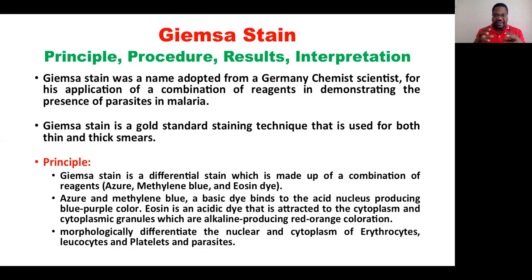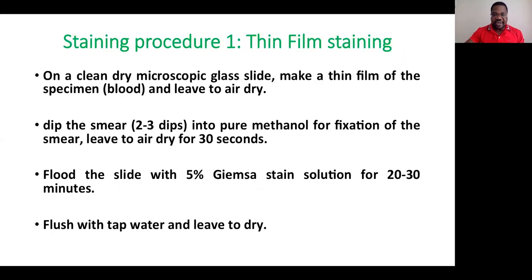Okay, so Giemsa managed to put all these reagents together, and if you use them, you are able to see different cells on this slide. Now, what is the staining procedure?